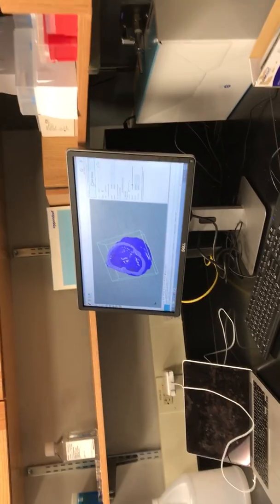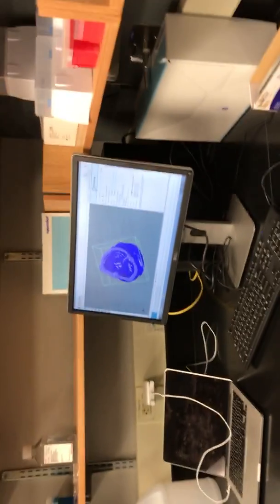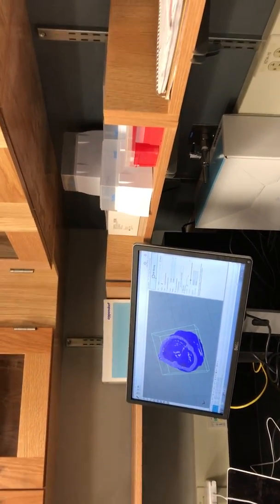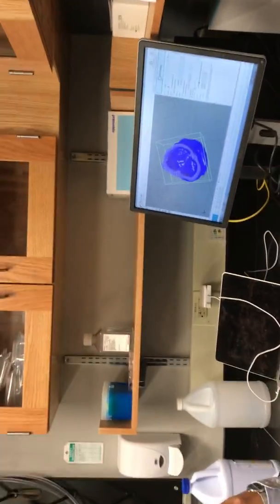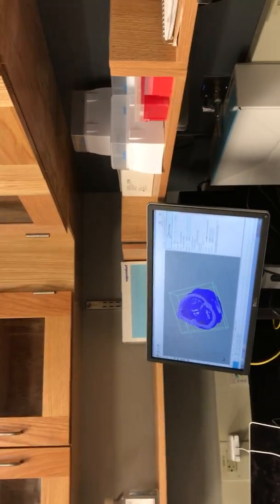Yeah, exactly. And what you want to print, is it basically just a film, or something more 3D as well? Not sure yet. Probably more 3D if we can. I mean, there's obviously a limit to how big we can go. Which type of bioinks are you planning to use?